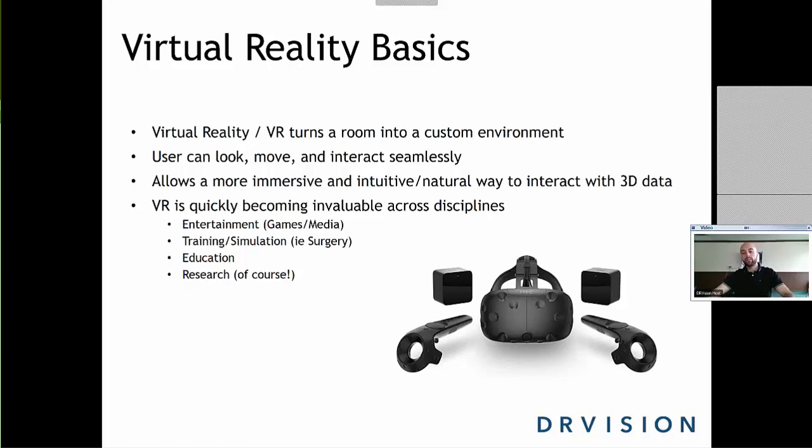And you're seeing it pop up everywhere, and it's for a good reason, because finally machines and graphics cards are basically to a point where it's usable and actually useful for real data. And soon enough, you'll see the headsets coming out with higher res and 4K, et cetera, for each eyeball, but it's not quite there. I'll go over what we have now.